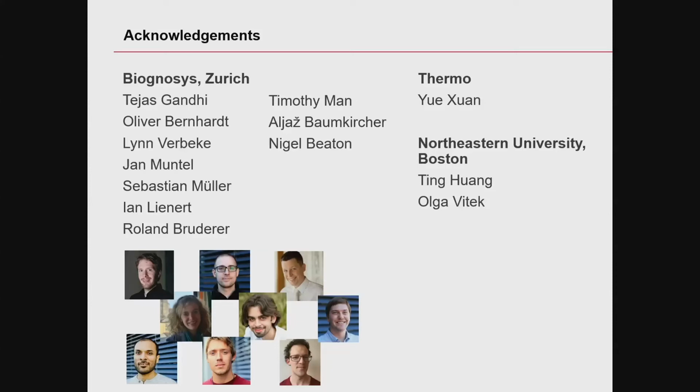And of course, the more fragment ions you are using, the more likely the scoring of Spectronaut will realize that there is a difference between the different forms of the phosphopeptide, right? So you can bias it more to the right way of analyzing. And then the second thing you can do is what I have shown here, this precision iRT. As soon as you have very precise iRT and you really know where to look very accurately, you can also bias yourself more to the right peptide with the right PTM. Of course, often these peptides elute very similarly, and then it will not be possible, right? So that's another thing you can do.